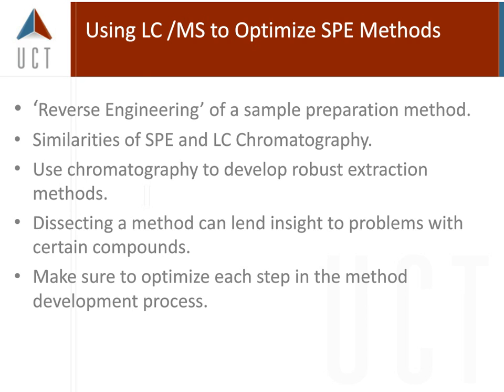And what I would like to talk about is reverse engineering what we do every day in the laboratory. We start out by preparing samples and then analyzing them. But many times when you analyze a sample, there are certain caveats that you run into: instrumental, matrix effects, dilutions, limited sample volume. All of these things come into play in finally getting an answer.